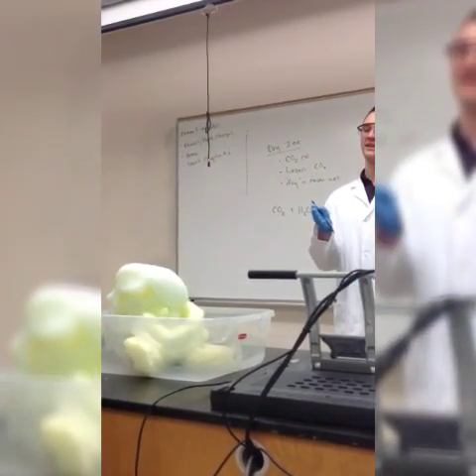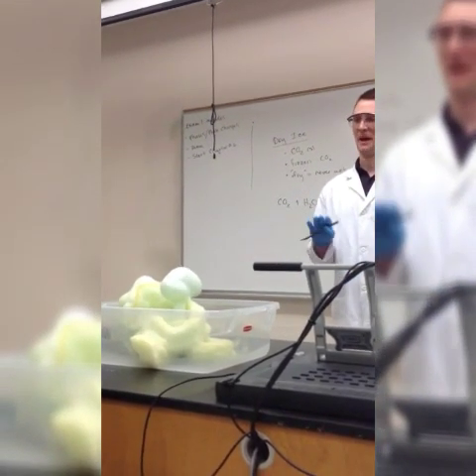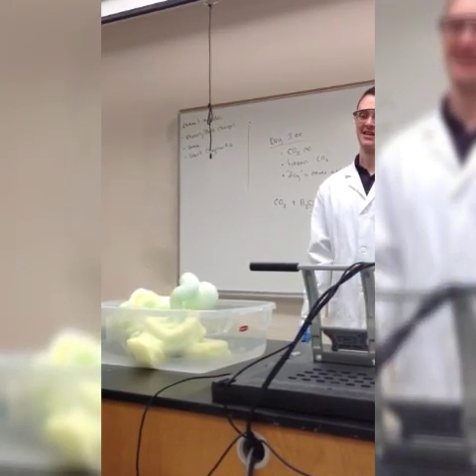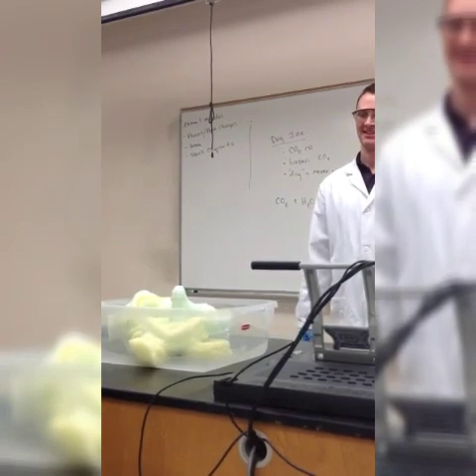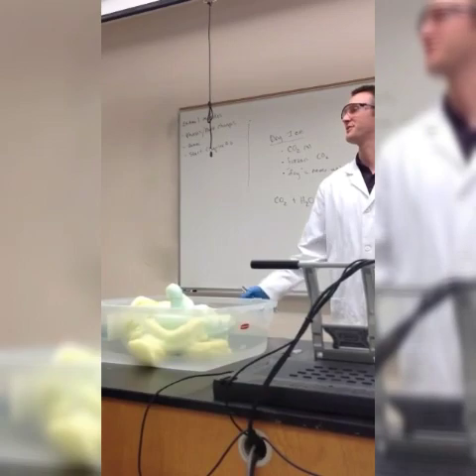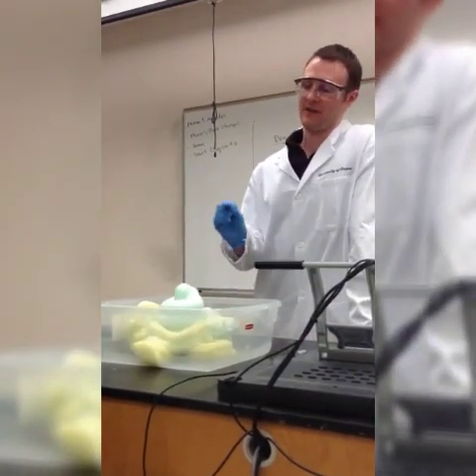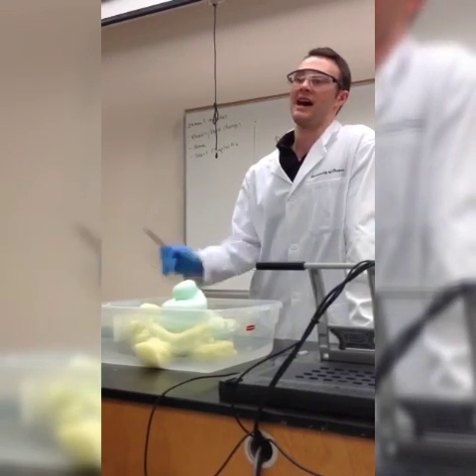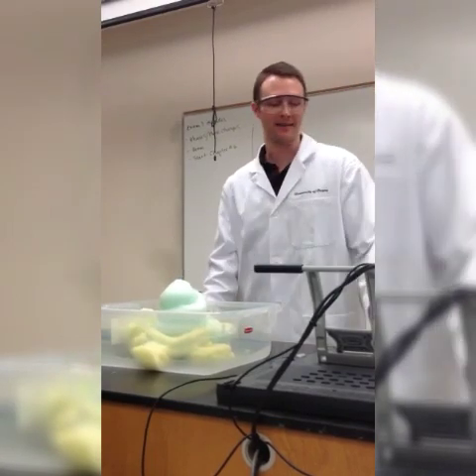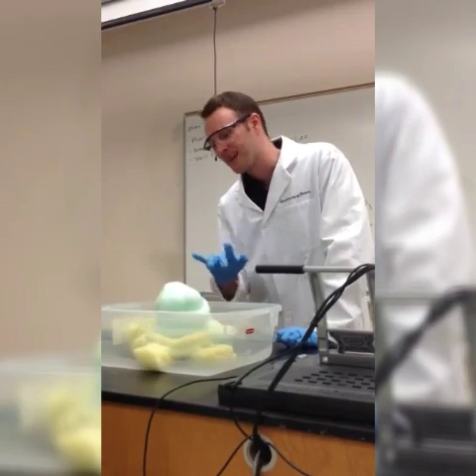So most of these bubbles are full of oxygen, just pure oxygen. And again, I added the soap just so we can see the volume of air that is coming out of this stuff. And the green's just added in. All of this stuff, everything that you just saw, was going to happen anyways, just over a much longer period of time. And by adding this catalyst, all I did was make it happen right now. Kind of intense, right?